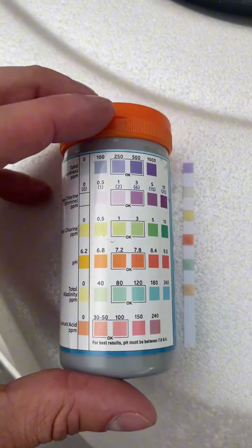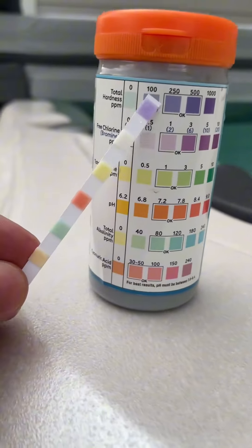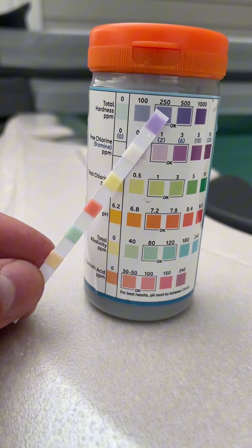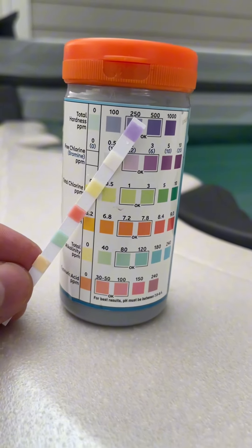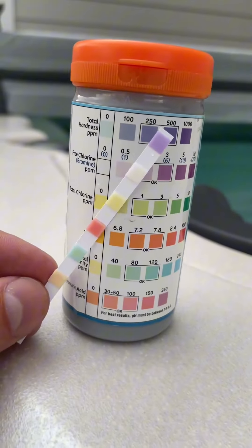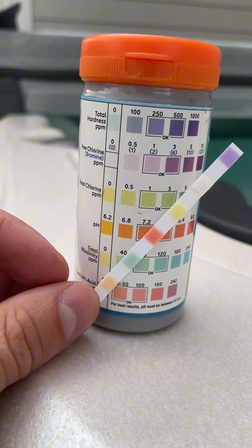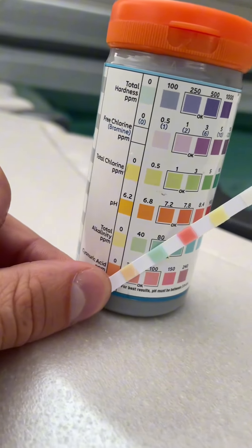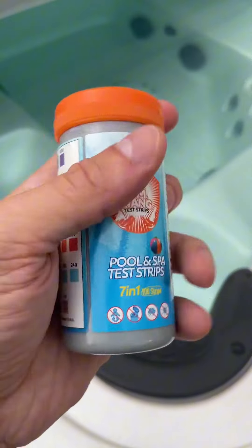Let me get a better angle — if I grab this and put it up next to the chart, you can tell that my hardness needs to go up a little bit. My bromine is very low because this is more of a chlorine pool, and my chlorine also needs to go up. We just barely filled up the water, so this is really important to test back and forth. pH is looking good, alkalinity looking good, and my cyanuric acid could go up maybe just a tad, but overall looking good.